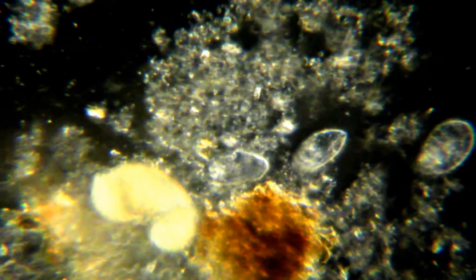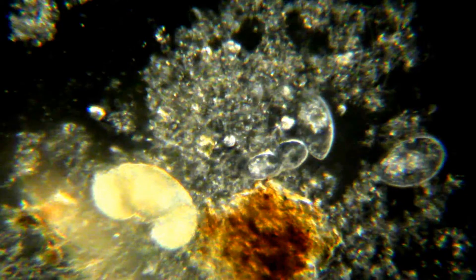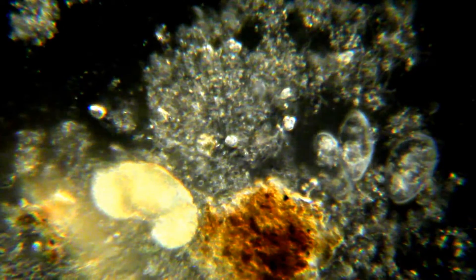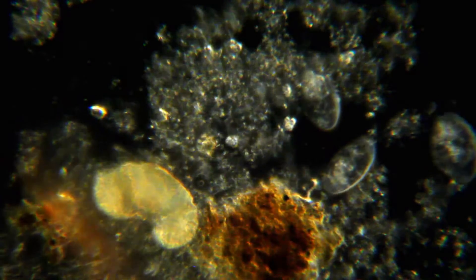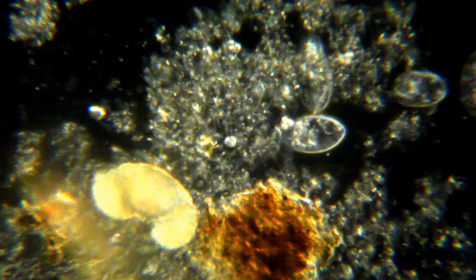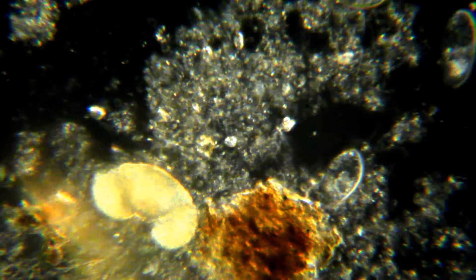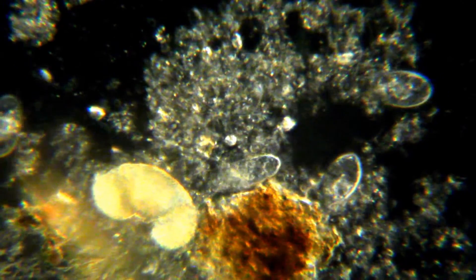Here's the Phase objective on it, and you can see it gives a better picture in Darkfield. For some reason that other 25 power seemed to make things look a little bigger too — I don't know why that is.